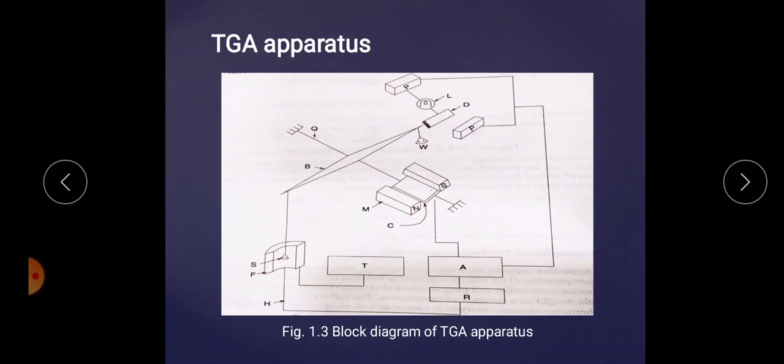In simple terms, there are the beam, weight and sample holder. When heating takes place, the weight of the compound decreases and the photomultiplier detects the change in weight, which gets recorded. Once an initial balance has been established, any change in the sample weight will cause the shutter to deviate from its original position so that the light falling on each photomultiplier is no longer equal.